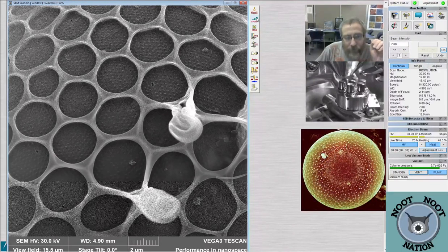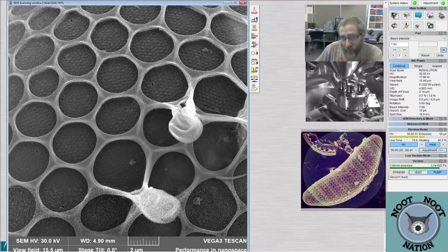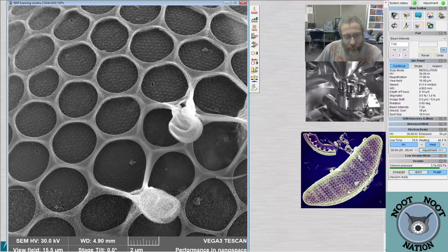But the quality of the image here would actually be a little bit higher, with a little more detail visible, but it would take 10 minutes to collect that photo. And if I set it to 9, which is the next speed down, you can see that the thing almost stops moving, and that would take about a half hour to collect this image.